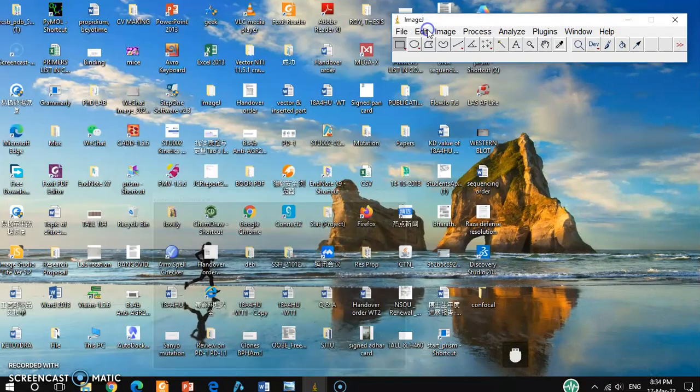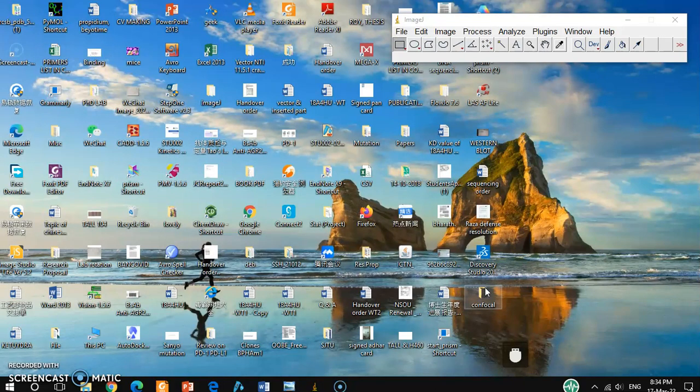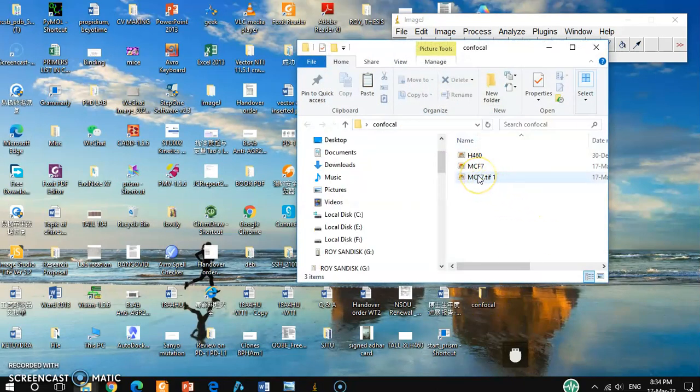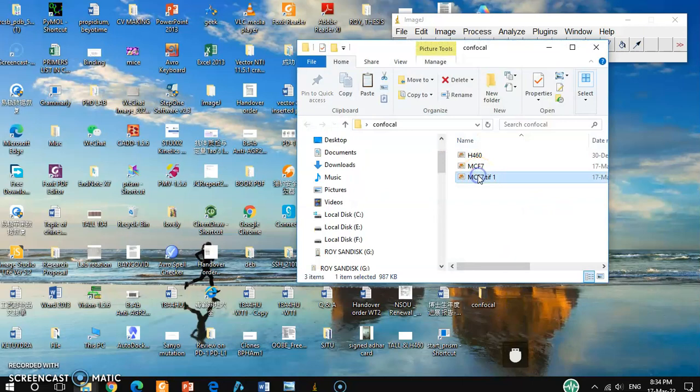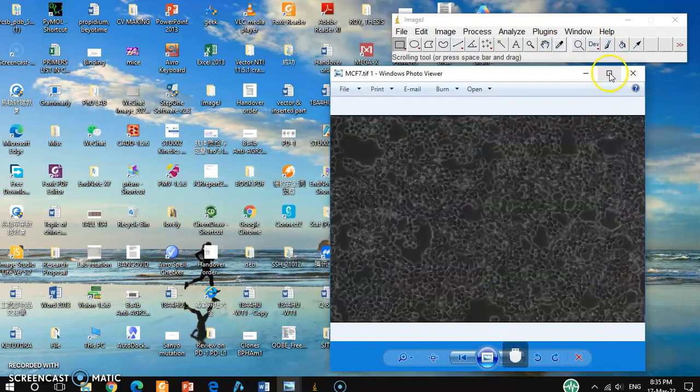So from here you can go to your folder and then you can open these pictures.